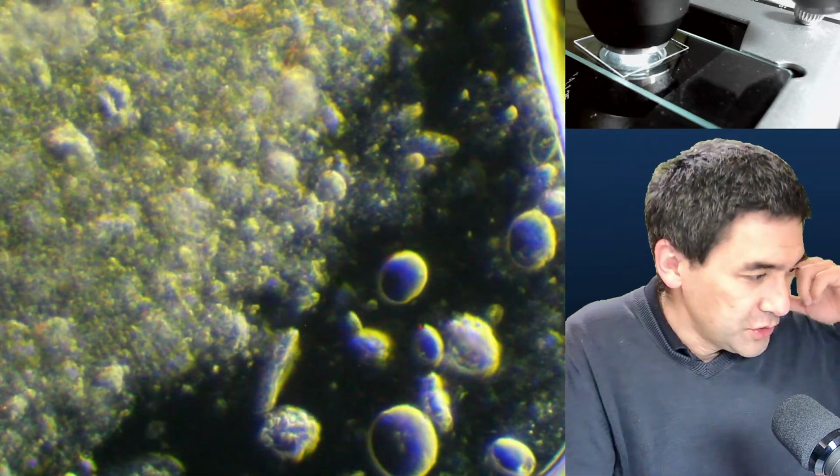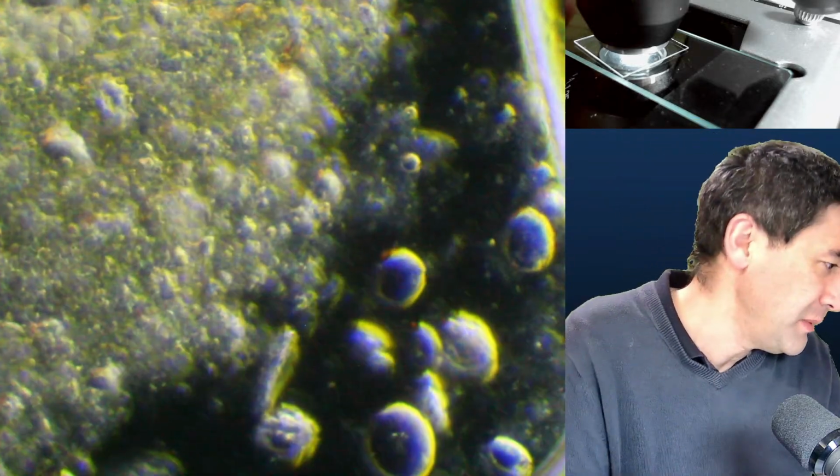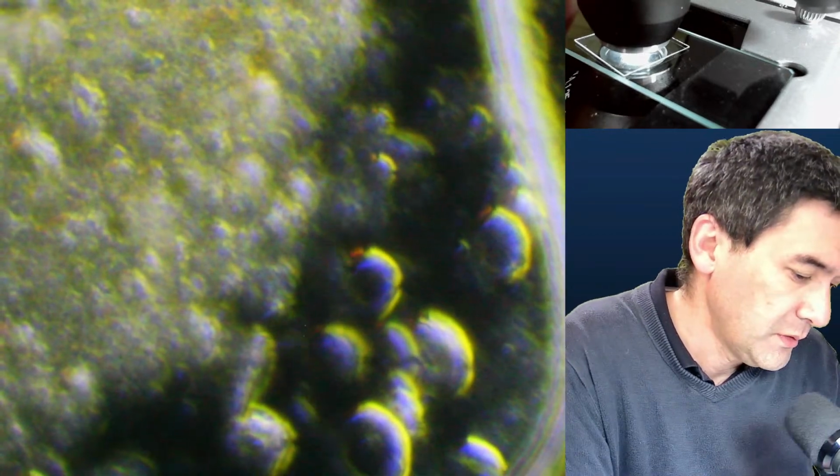So I just want to show you a couple of other specimens, maybe. Let me put this one away here. We looked at the potato. Let me check the time a little bit. So there's something interesting here as well. This is a pear, a pear fruit.